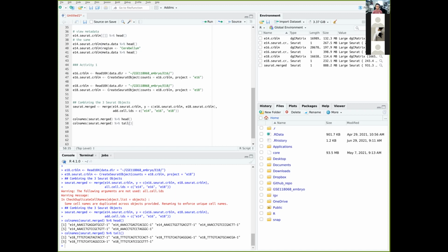All right, so you might need to know a little bit of how to figure out what is the maximum value of a vector, but it's not difficult. It's the same thing as head and tail, just that you have to use a different function. So again, 2 minutes, try this out. I'll show you the answer after 2 minutes.